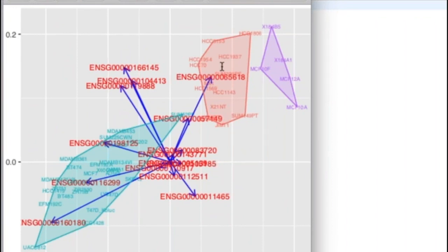Okay, so these arrows are called loadings, and what does it mean? Let us imagine, for example, three-dimensional space and three axes. You know they are orthogonal to each other, and what does PCA actually do? It selects one more set of axes, for example, just like this, and then makes a projection to two of them, and then we can project the initial axes too. So these axes are projections of the initial axes, and our initial axes were gene names.